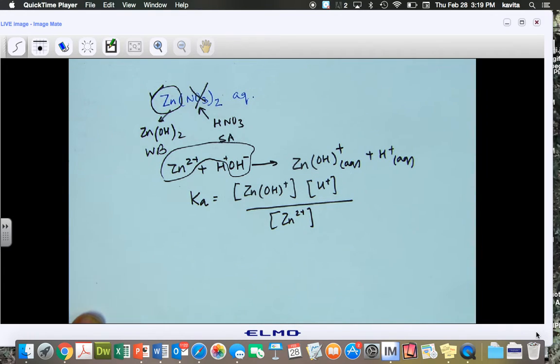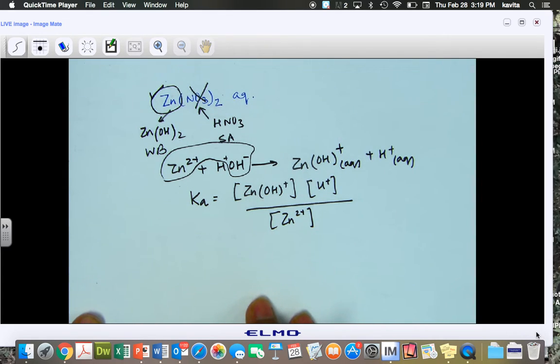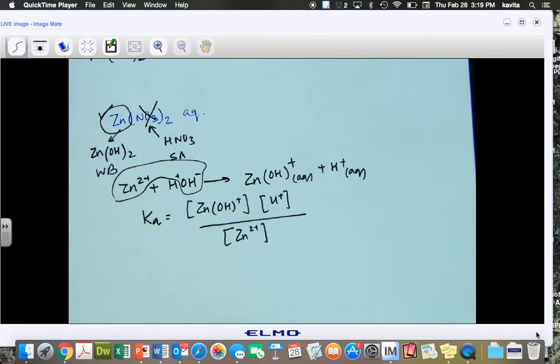Now, a couple of things, and this is how you will fill in the pre-lab table: identifying which ion, or both, or none will hydrolyze, and writing these as either Ka or Kb or Kw. If neither ion hydrolyzes, then you write the Kw expression. And let me show you where you'll do it. Let me just quickly grab a packet.